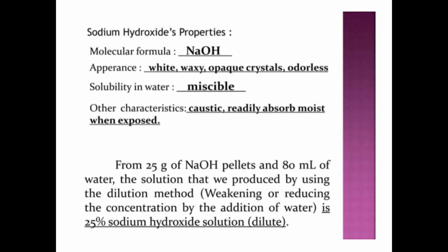For sodium hydroxide, the molecular formula is NaOH. Its appearance is a white waxy opaque crystal which is odorless. It is miscible in water. It is caustic in nature and readily absorbs moisture when exposed to air. Of course, that's deliquescence; it is deliquescent in nature.